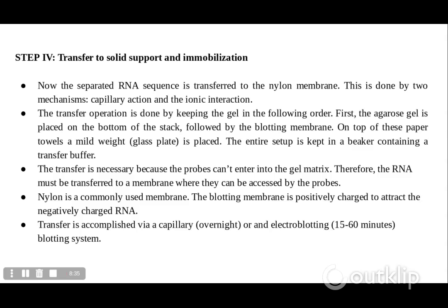The transfer is necessary because the probe can't enter into the gel matrix. Therefore, the RNA must be transferred to a membrane where they can be accessed by the probes. Nylon is commonly used, and the blotting membrane is positively charged to attract the negatively charged RNA. Transfer is accomplished via capillary action, as I said, or by electroblotting, that is around 15 to 60 minutes, 15 minutes to 1 hour in a blotting system.